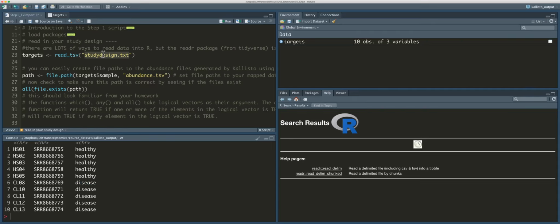Your study design, if you're doing this, should include as much information as you know about your samples. All right, and I can't emphasize this enough. If you collected information about sex, age, cage effect or cage assignment, if it's a mouse experiment, whatever experimental variables you recorded, those should be stored in a simple text file like I've done here, because then if you read that into your R environment, those variables are available to you to interrogate and ask whether they impact gene expression, ask whether they contribute to an outlier, allow you to filter your samples.